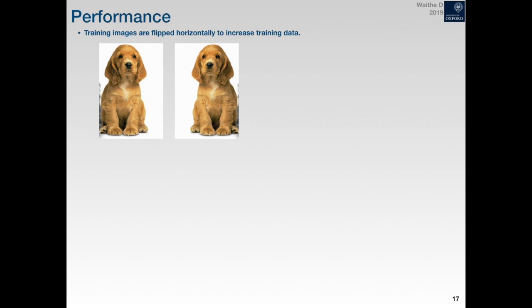So it turns out that conventionally, when you do object detection on photography, you do a lot of data augmentation, and I think Mix will talk about this, where you try and amplify how much training data you have by flipping it around and rotating it, creating subtle variations to increase the diversity in what you're using to train your algorithm on. And in photography, you flip things left and right to do that, but you don't tend to flip upside down, because you'd never see in life upside down dogs and upside down cars. So if you train an algorithm to try and recognize those things, it's kind of wasted resource in a way, because it won't see it in reality.